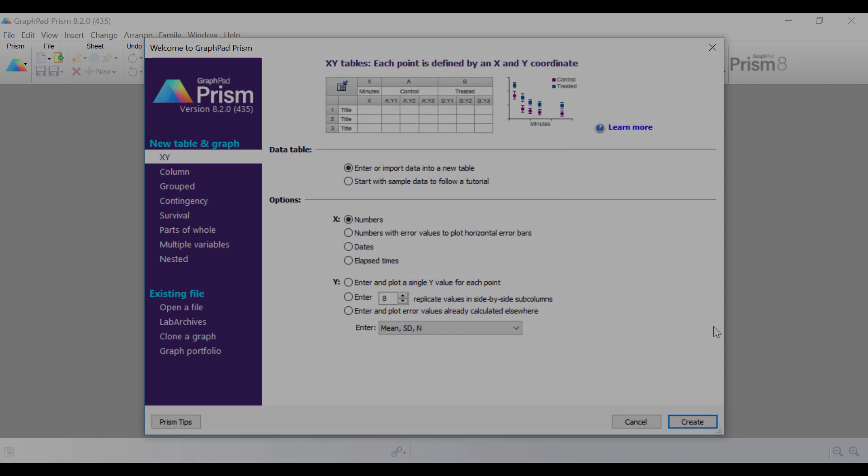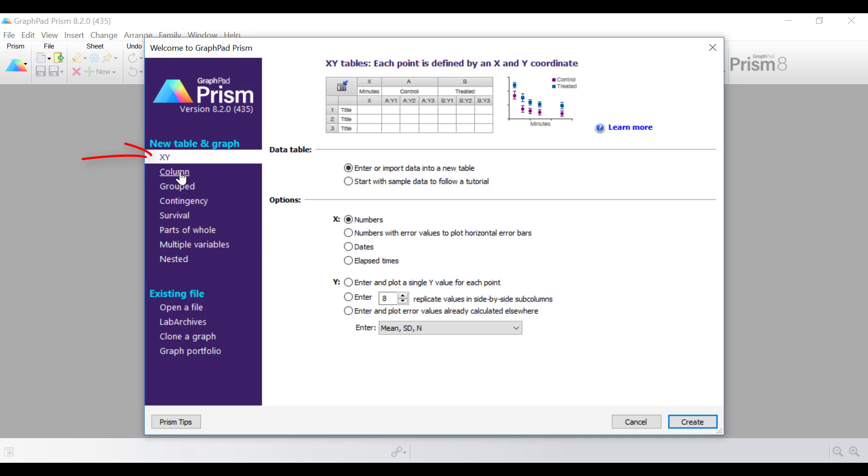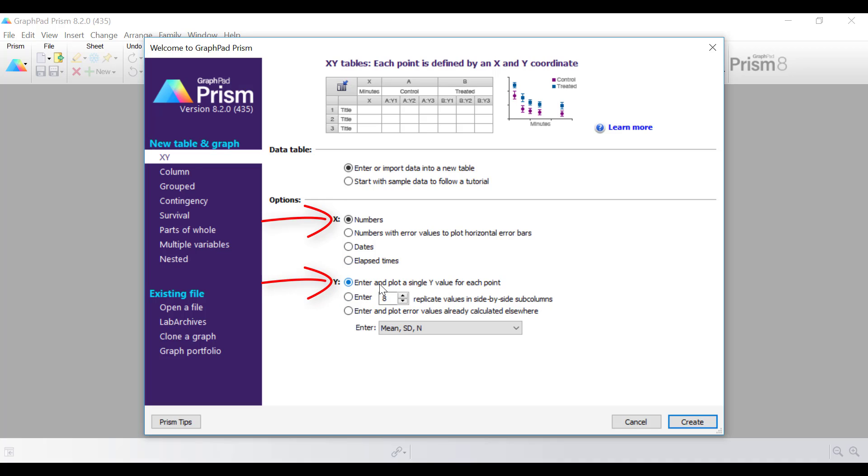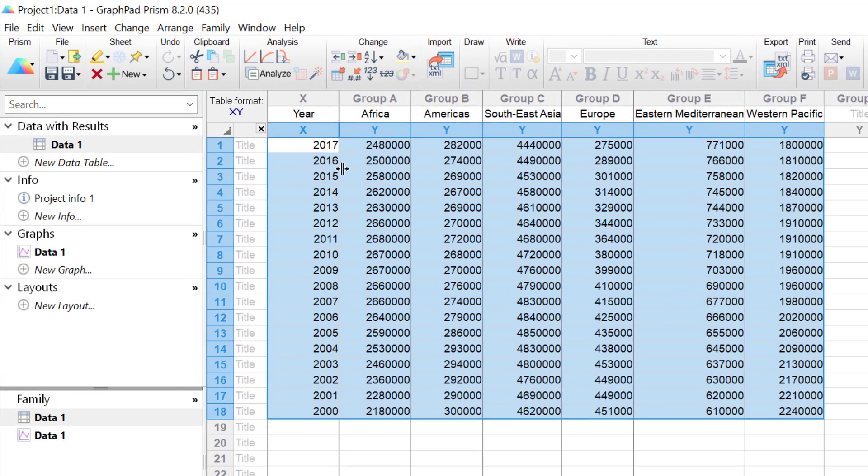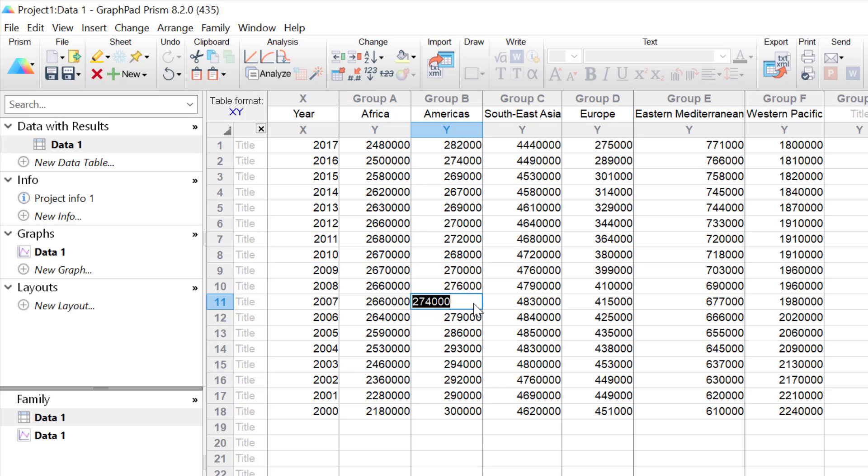In the setup window, I'm going to select an X, Y table and graph. I'm going to enter or import data into a new table. My X values are going to be numbers, and my Y values I'm going to enter and plot a single Y value for each point. I'll click the Create button. I'll now just paste in the data that I have prepared earlier. Specifically, this dataset is from the World Health Organization database, and it contains the incidence of tuberculosis cases in six regions between the years 2000 and 2017. So the X values are the years, going from 2017 at top to 2000 at the bottom. And then each group thereafter is a different region.